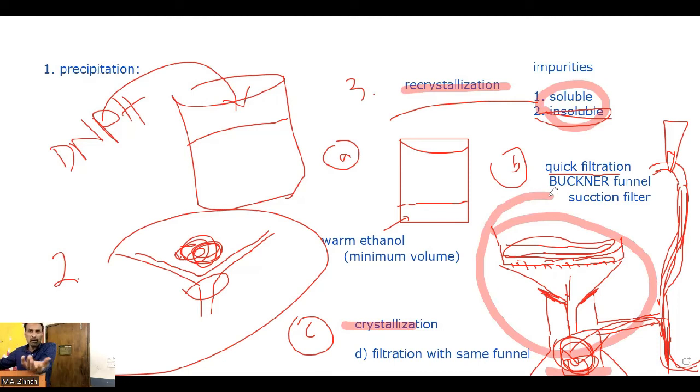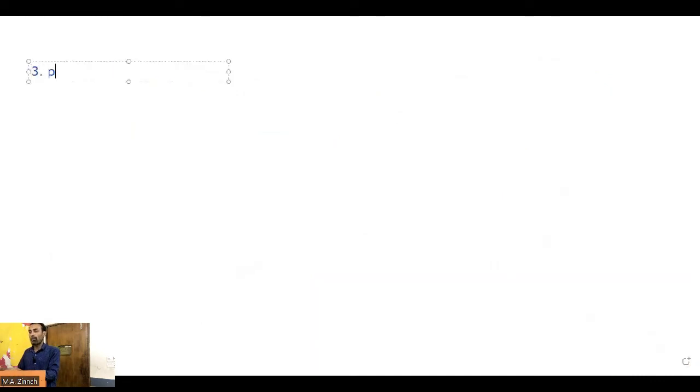তো এবার প্রিহিটেড এর কোনো দরকার নেই। So now we get here the solid. এই সলিড অটোমেটিক্যালি ড্রাই হয়ে যাবে, as this is suction filtration, ফিল্টার করতে করতে ড্রাই হবে, কি বুঝে গেছে? নিচে থেকে সাক করছে যেহেতু, দ্রুত এটা ড্রাই হয়ে যাবে. So this is another advantage of using Buckner funnel. So ultimately finally কি পেলাম বলো দেখি? Finally we get pure crystals.